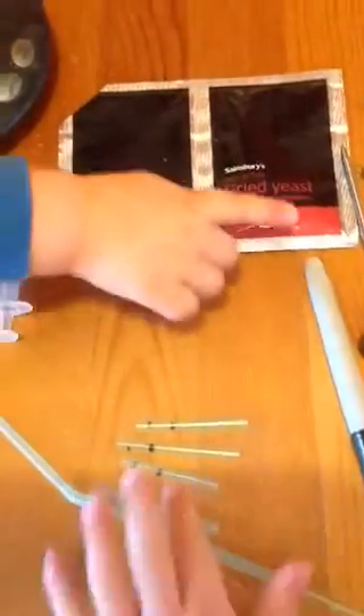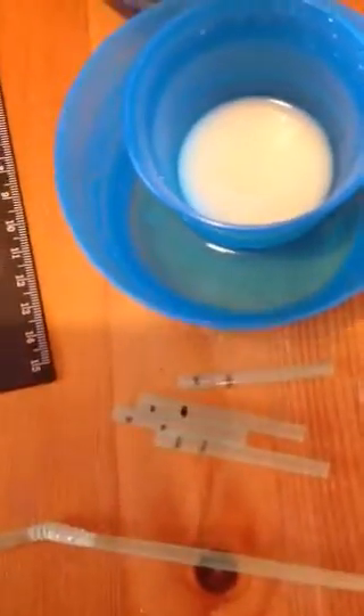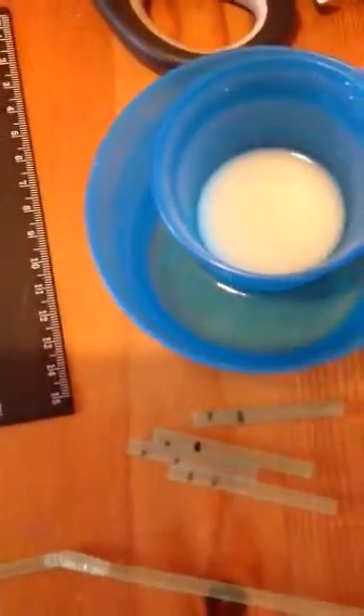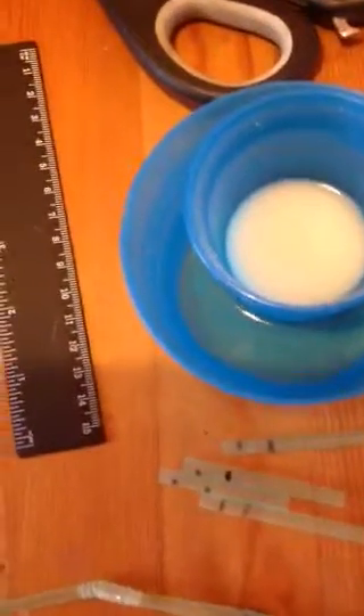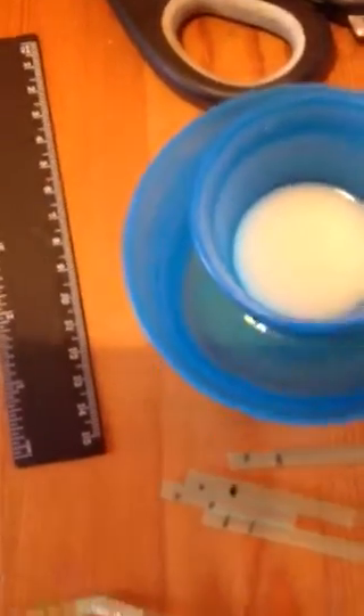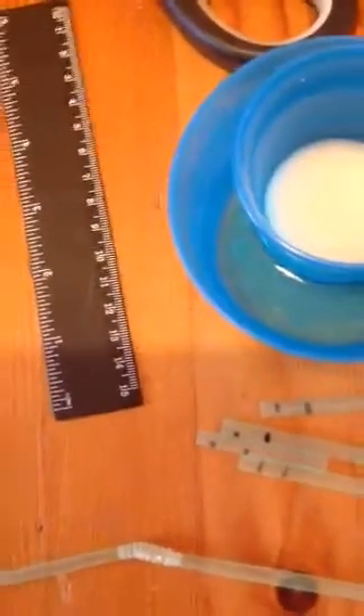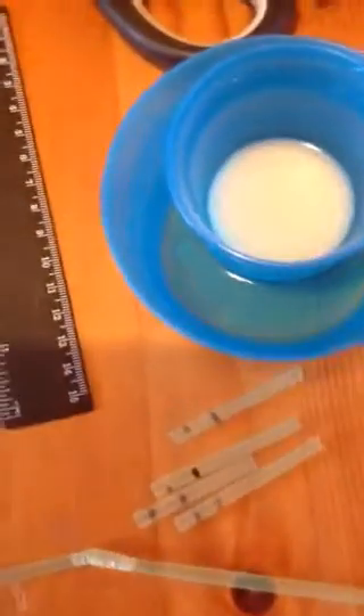Here we have what you need for experimenting with the effect of temperature on the rate of reaction in dried yeast. You'll need straw — one straw can be cut into four pieces. Put two marks on each of the four pieces so that you can measure the time it takes for the carbon dioxide bubble to move from one mark to the next. As long as the distance is the same between each straw it doesn't really matter what the distance is. You can work that out depending on how much time you've got. A ruler to measure the distance between the two markings.